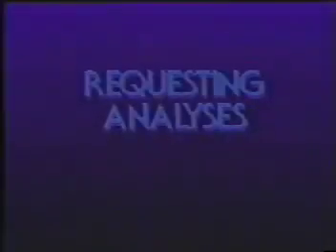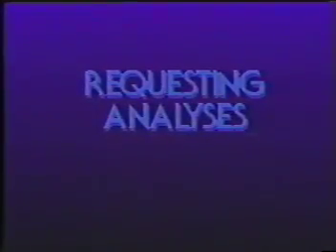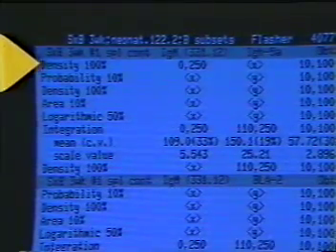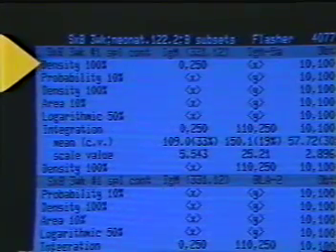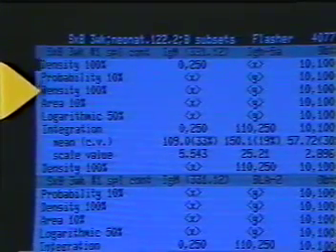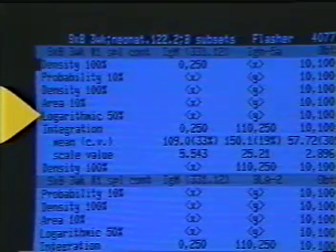It's important that you familiarize yourself with the format of each type of analysis request. Let's take a look at the variety of analysis requests that have been placed for sample A1A. On the first analysis line is a request for a 100% density Texas Red histogram. The next 4 requests are for different types of red versus green contour maps.